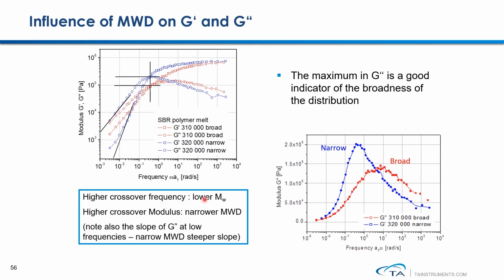If a polymer shows a higher G crossover modulus, it may have a narrower molecular weight distribution. To compare polymers with different molecular weight distributions, sometimes people simply plot the loss modulus as a function of frequency and compare the shape of the curve, or take the peak value of the loss modulus as an indicator. We can also compare the differences in the broadness of molecular weight distribution.